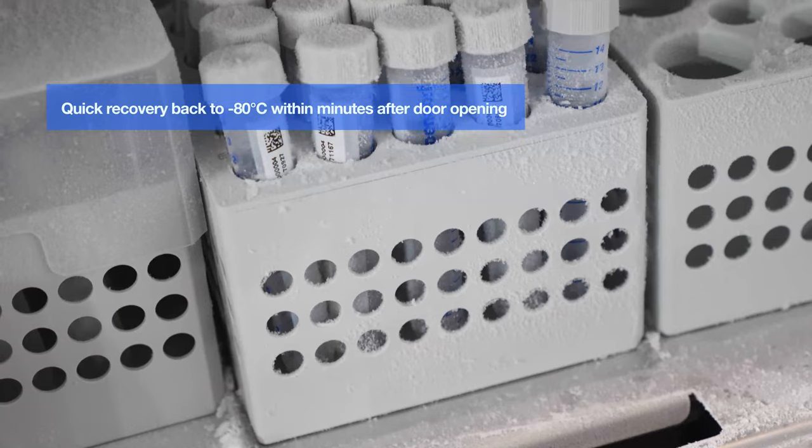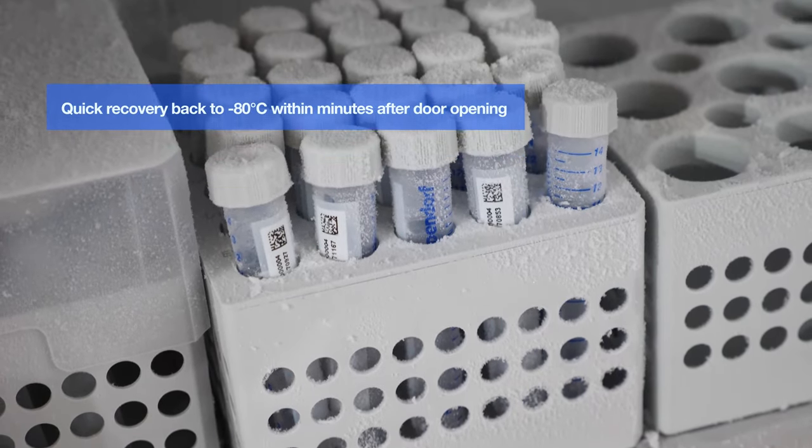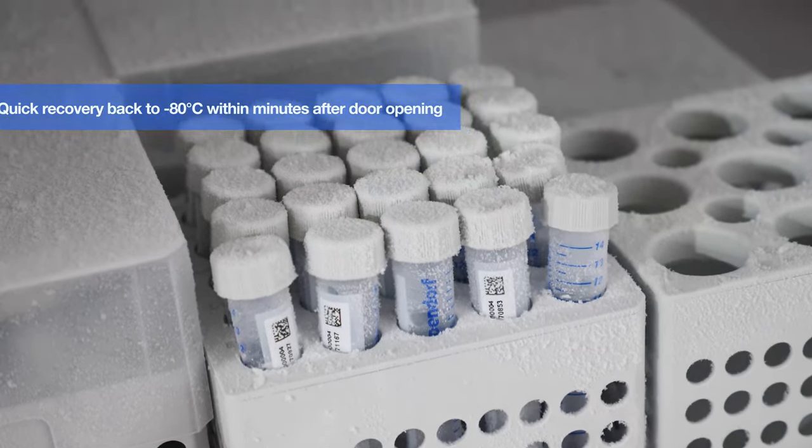The pull-down time and recovery time is also very important for the freezer because that's giving you security for your samples. When you open the freezer, the temperature is rising, so you have to close it again. The freezer is pulling down within a few minutes.